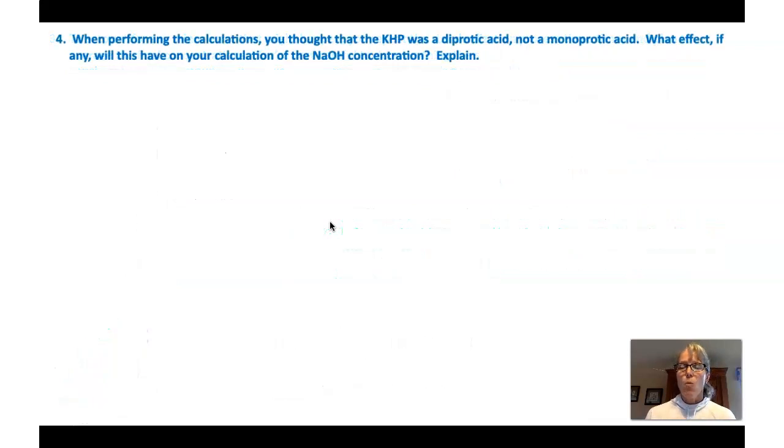Question 4. When performing the calculations, you thought that the KHP was a diprotic acid, not a monoprotic acid. What effect, if any, will this have on your calculations of the sodium hydroxide concentration? Explain.